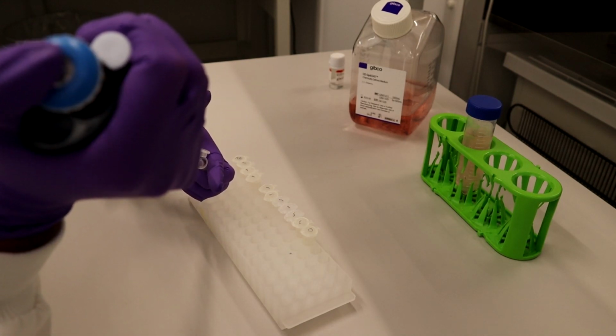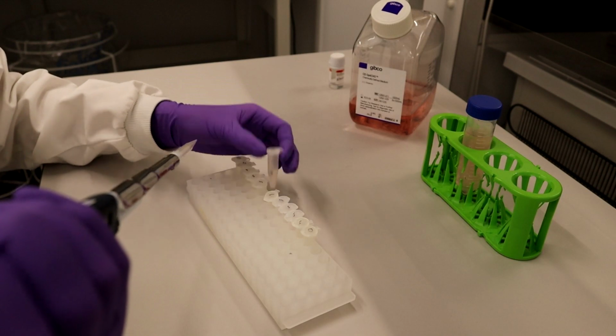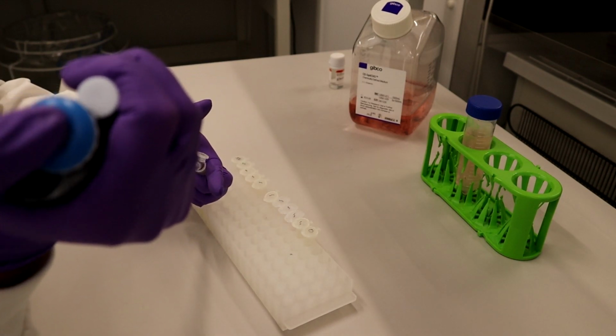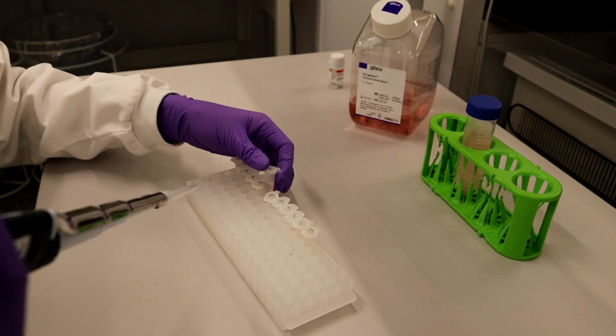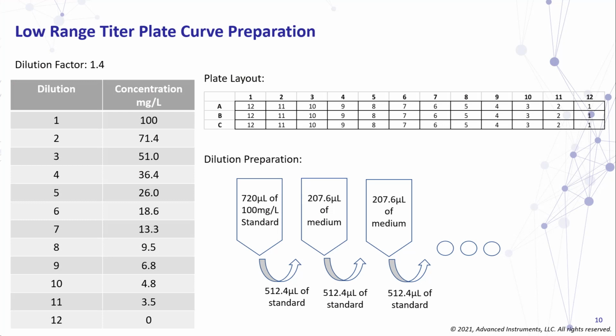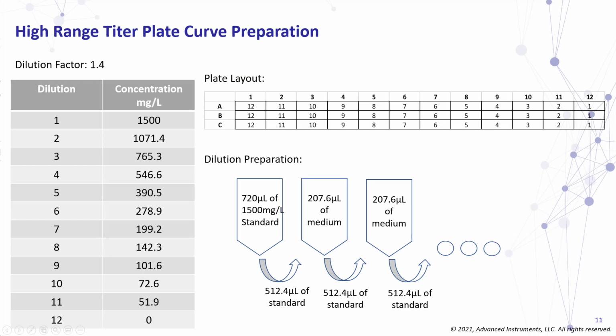The easiest way to do this is via serial dilution using a calibrated P1000 pipette. Each well requires 60 microliters of standard, and enough should be available to run each concentration in triplicate. Advice on the best way to do this is displayed on the screen above. Once you have prepared the appropriate serial dilution of your standard IgG molecule, you are ready to set up your titer plate.